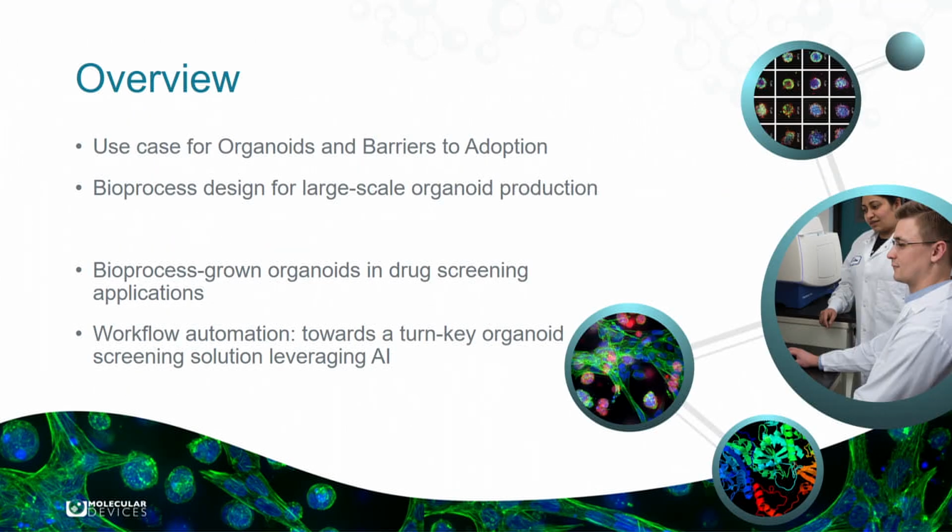But to begin with, I'm going to start the presentation just by telling you a little bit about the use case for organoids and some of the work that we've been doing to develop a bioprocess for the large-scale expansion of organoids. And then when I'm done, I'll hand over to Angeline, who'll be telling you a little bit more about the work that Molecular Devices has been doing to automate the organoid culture process and also to automate organoid-based drug screening.